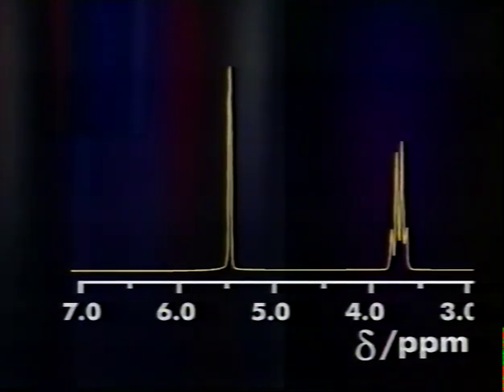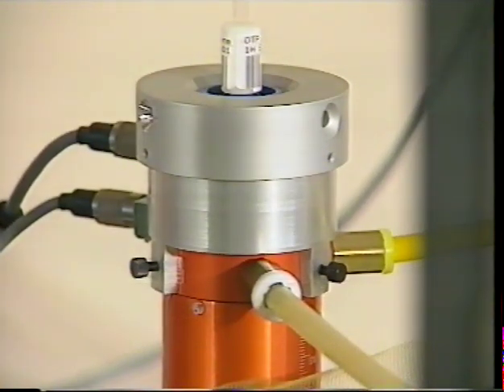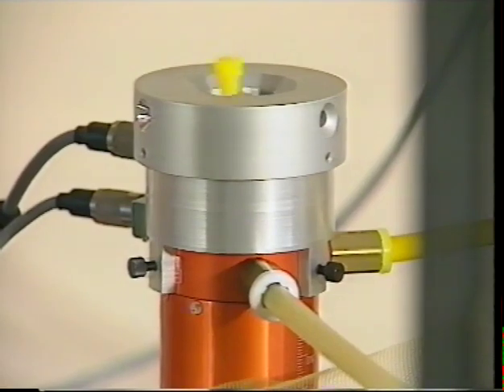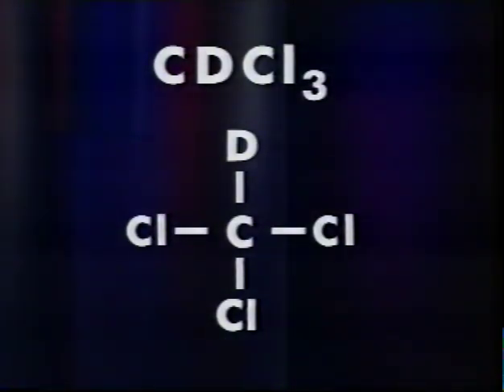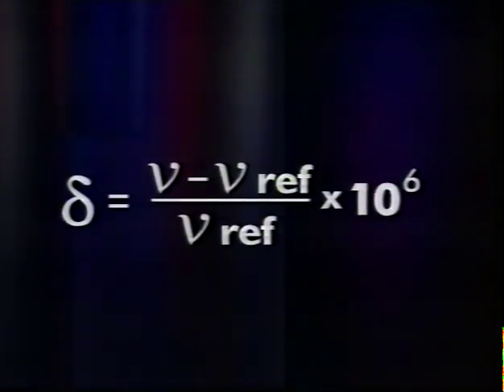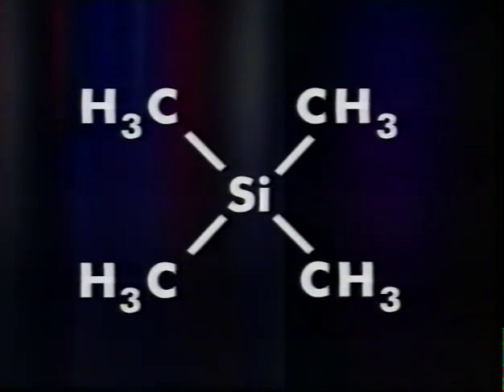So finally, let's recap on the basic techniques we've now learned. Firstly, NMR spectroscopy is used for compounds whose empirical formula is already known. For proton NMR, our sample needs to be in a proton-free solvent. Usually, a deuterated solvent is used. The NMR spectrum shows a scale increasing from right to left. This is known as the delta scale, with 0 set to a reference standard, and in proton NMR the standard used is tetramethylsilane, TMS.